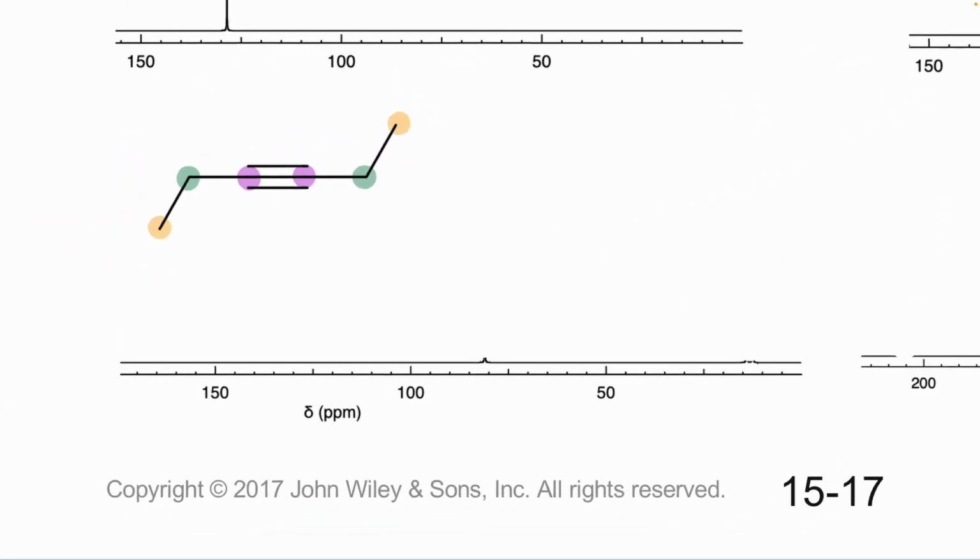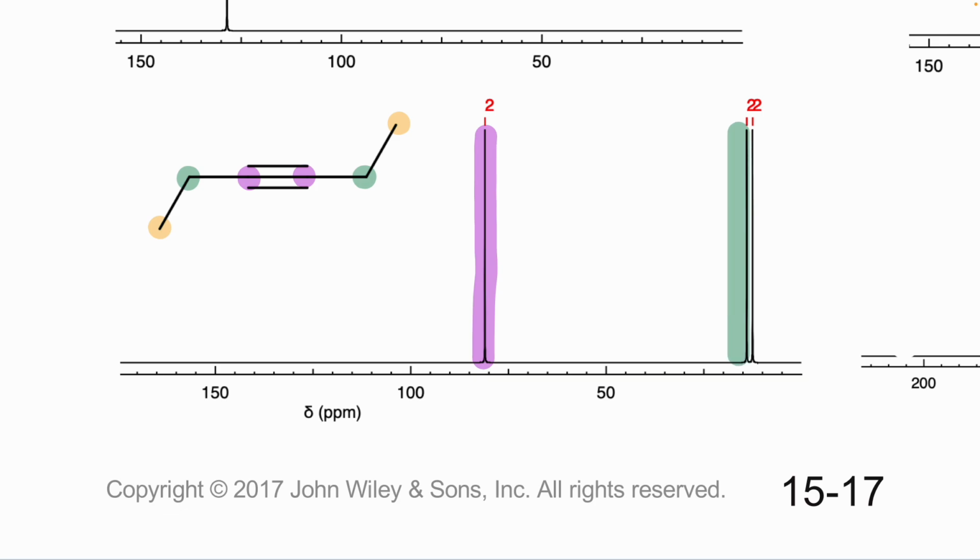All right, so if we look at our spectrum here, we got 2 peaks all the way on this end and 1 sitting in that triple bonded region, right? This one corresponds to that purple carbon. Over here, I'm sure there's a rule for methyl versus the internal that I don't know, but we're just going to assign them. One of them's green, one of them's orange. Should probably know that.